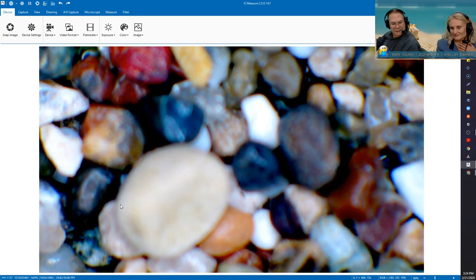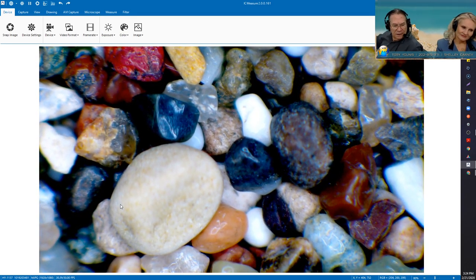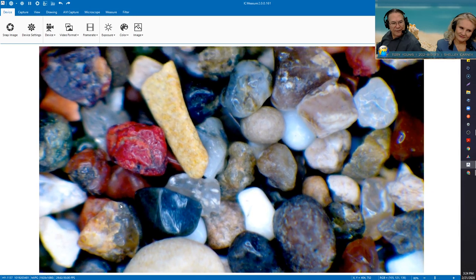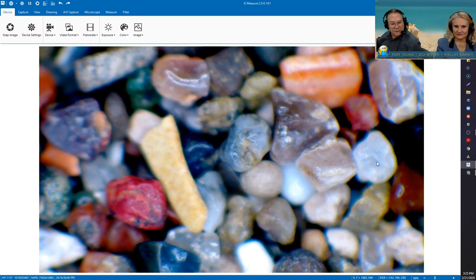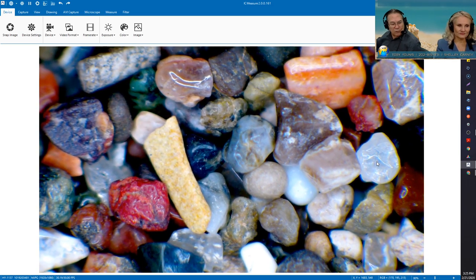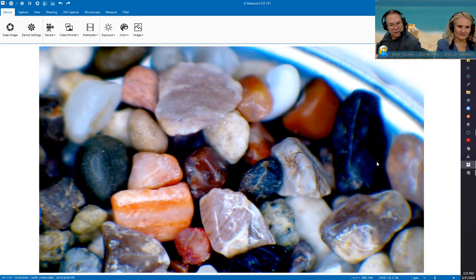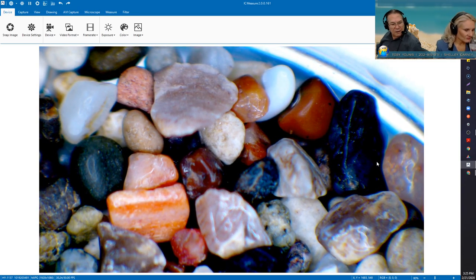And that white object there, you can see the little telltale holes that come from the foram feeding arms. But more rock than anything else. This one over to the right was as close as I got to anything that looked like a translucent or clear quartz, but I couldn't even be sure about that, because it looks more rocky than anything else. There is some polished shell material in there, but the dominant set is from rock.